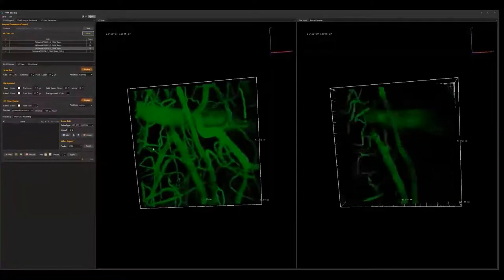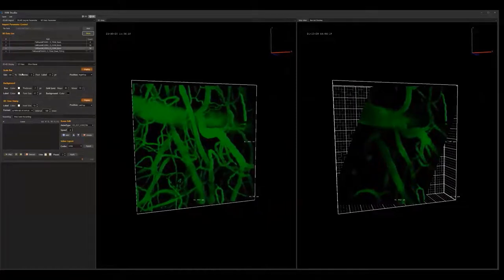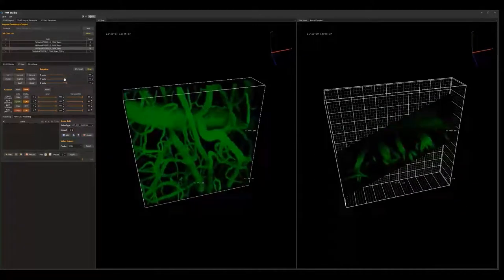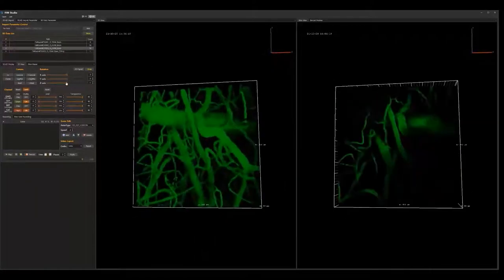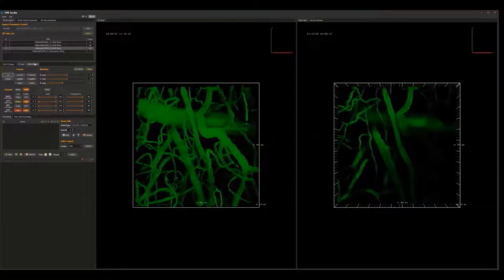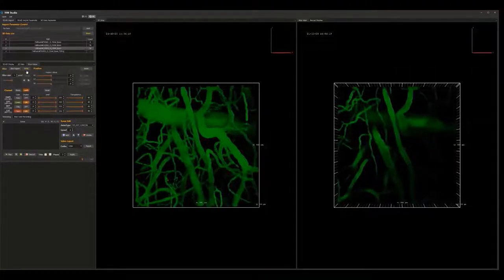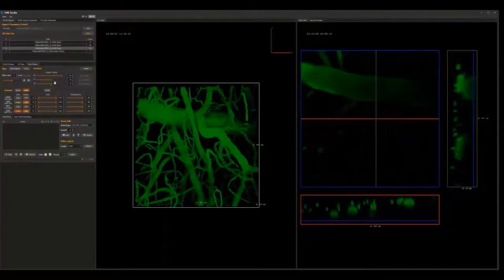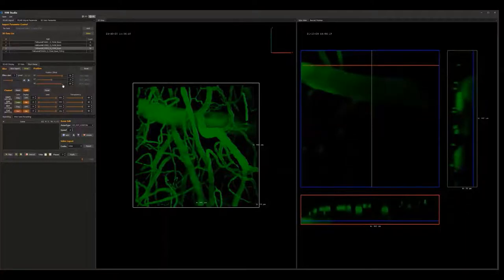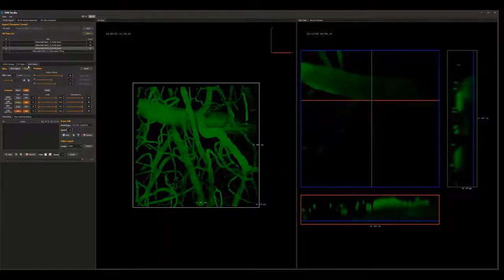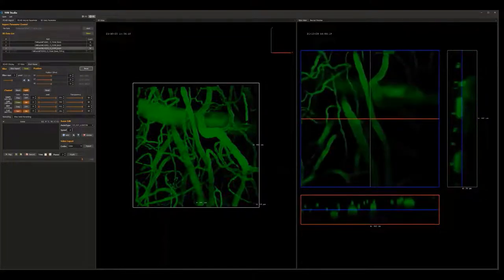We can make a freehand rotation of the 3D data, and in the 3D view tab, rotation in all three axes is also available. In the Slice Viewer, we can get cross-sectional data along every X, Y, and Z axis. We can then go back to the original position by clicking Reset.